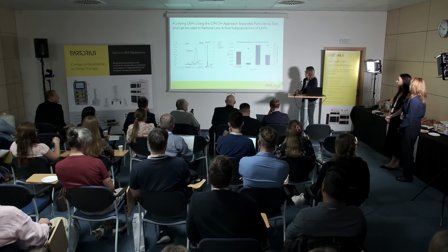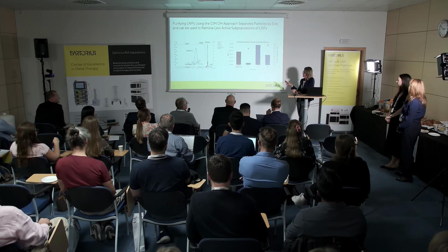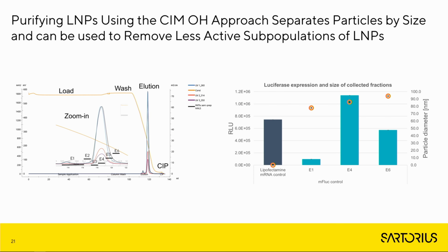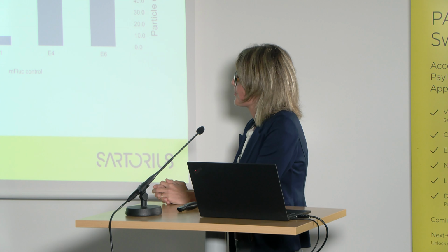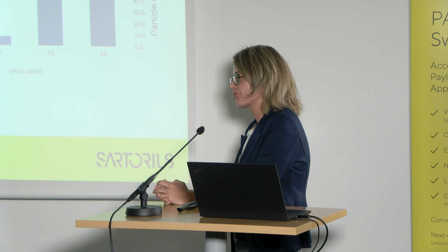Yeah, this is actually what we try to understand. We got a certain separation here. We know it's different activity, different size, but the real mechanism is still to be studied. We already talked before about some of your techniques. Anything like surface properties or PEGylation?